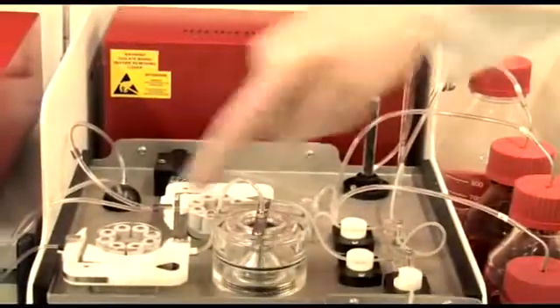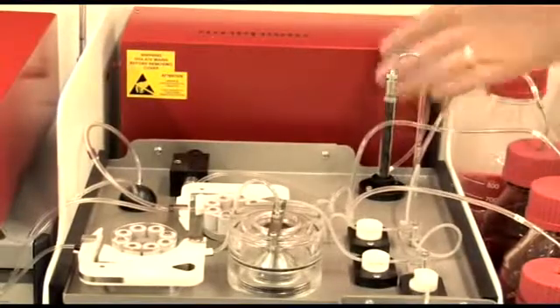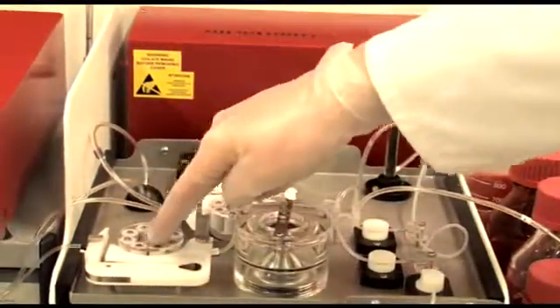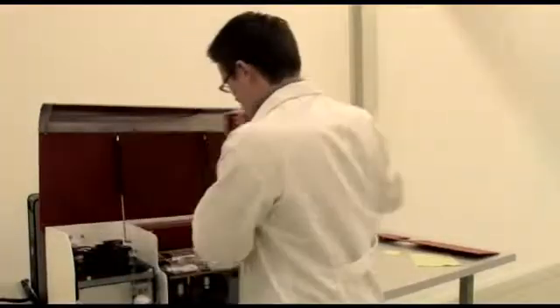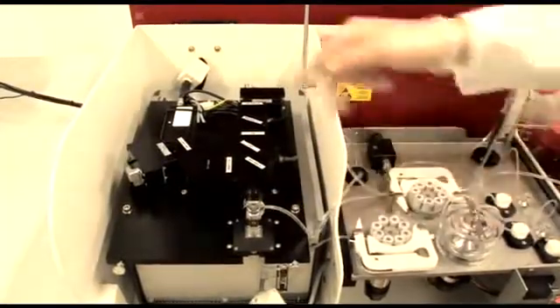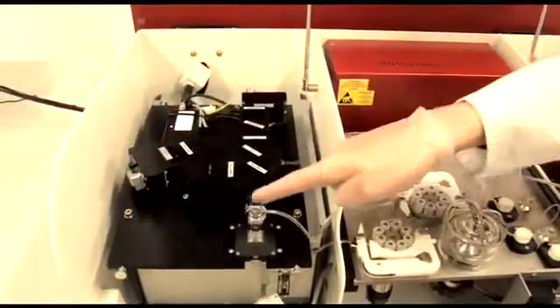The sample preparation unit consists of a syringe, two peristaltic pumps and a mixing unit. In the optic unit we find the flow cell, two photomultipliers and a microscope.